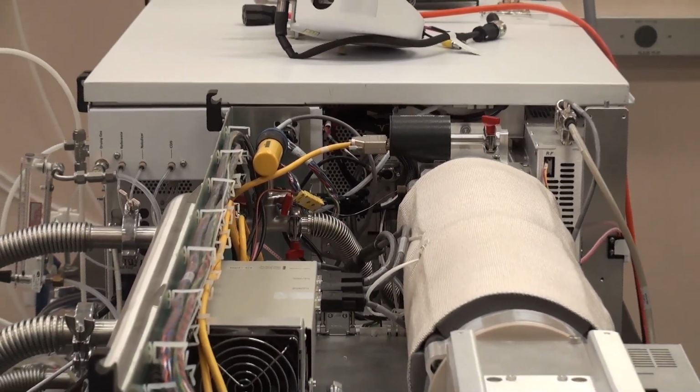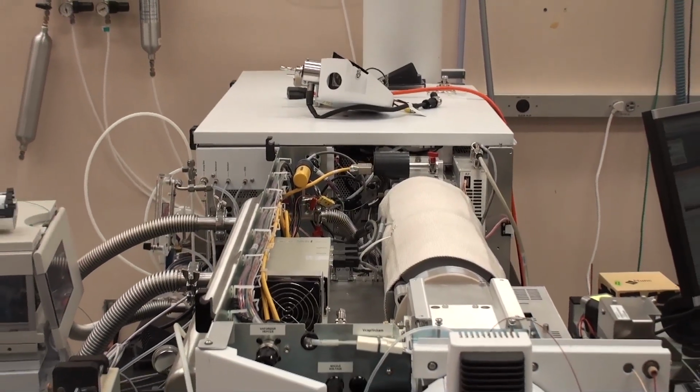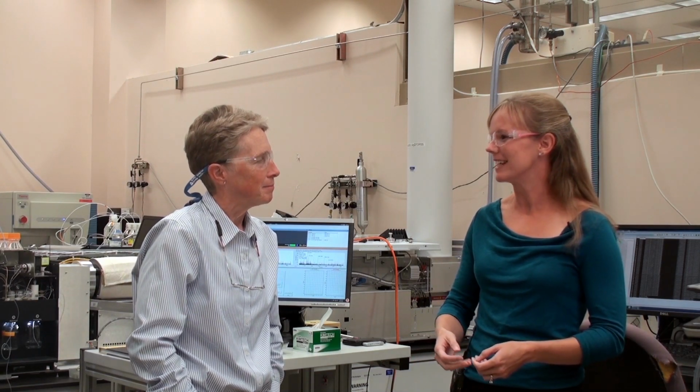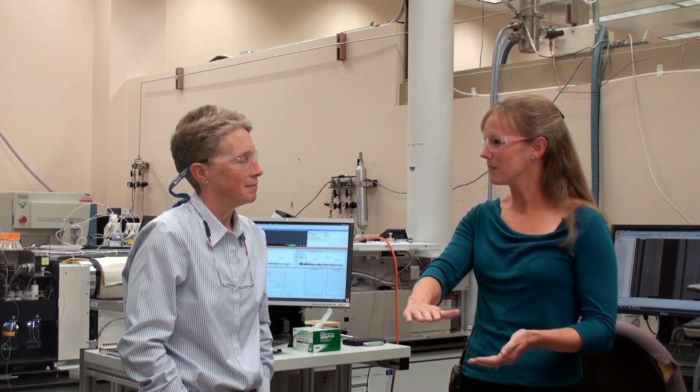So the biggest challenge I have in my area is the sample types. Even urine, there's some people where their urine samples are basically orange, and other people where their urine samples are pretty clear. And so all the different components in the urine samples cause the instruments to get dirty at different rates. And so we have to make sure that we clean the instruments enough that we analyze every sample and give it a fair shot in the instrument. Do you separate out any cells that might be in there? So we separate out any particulates.